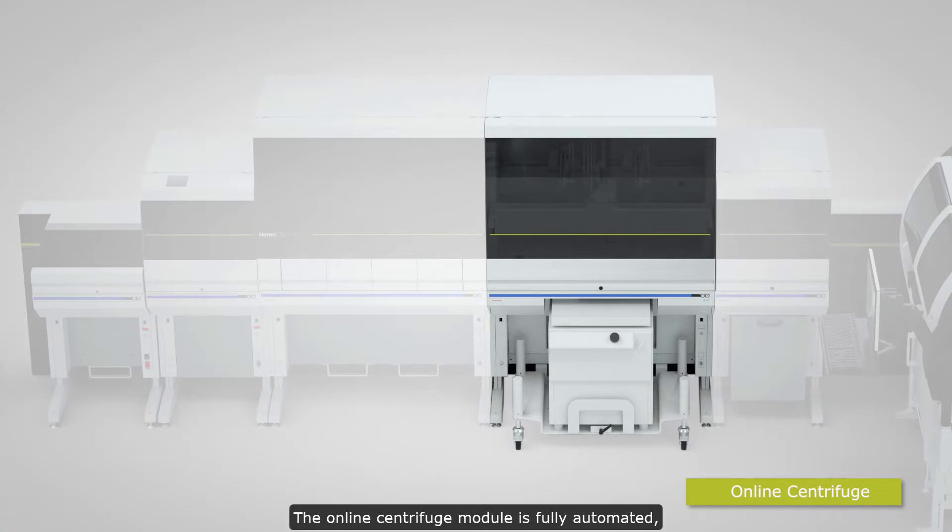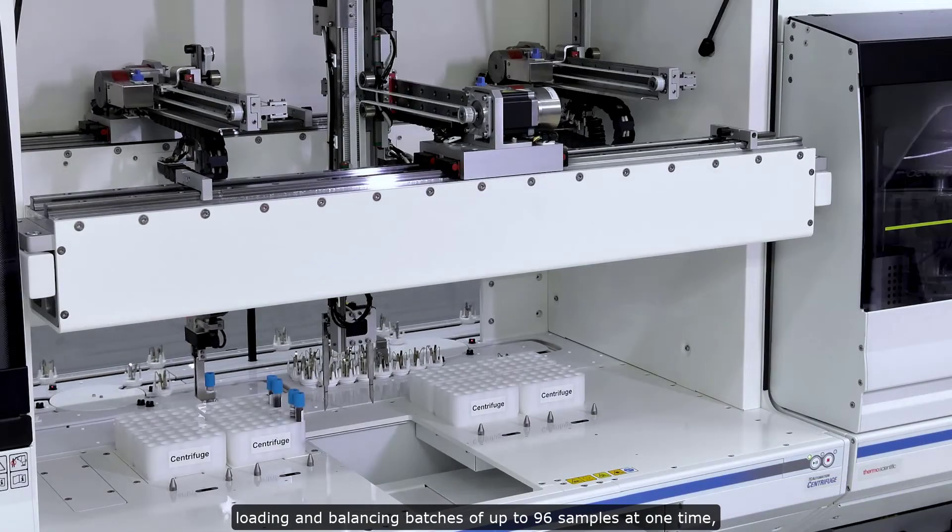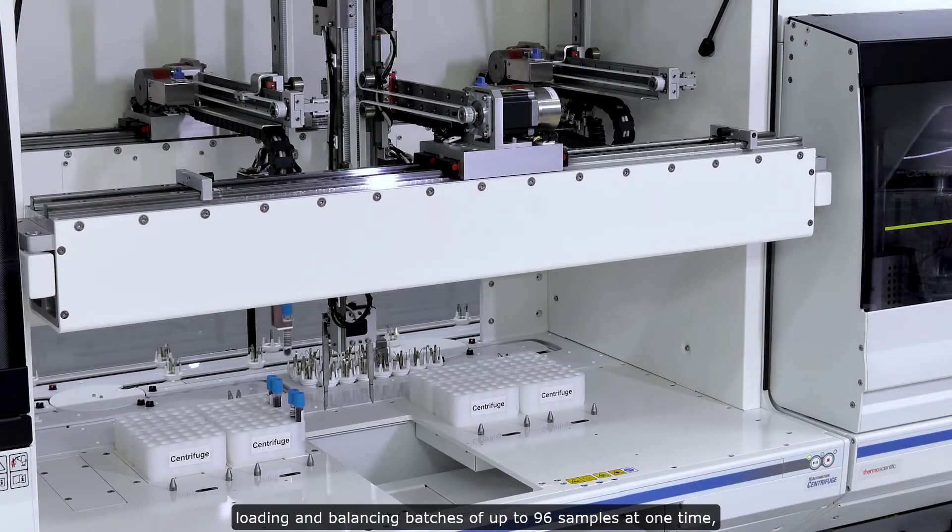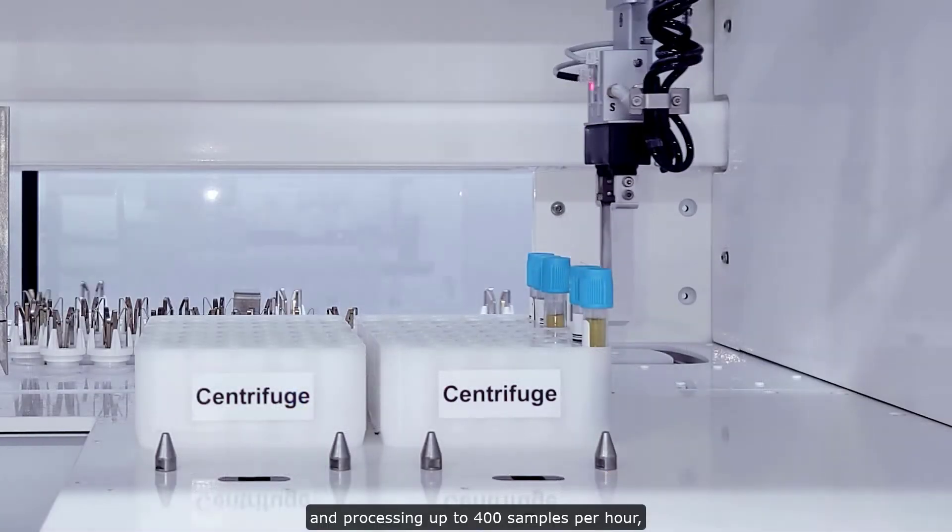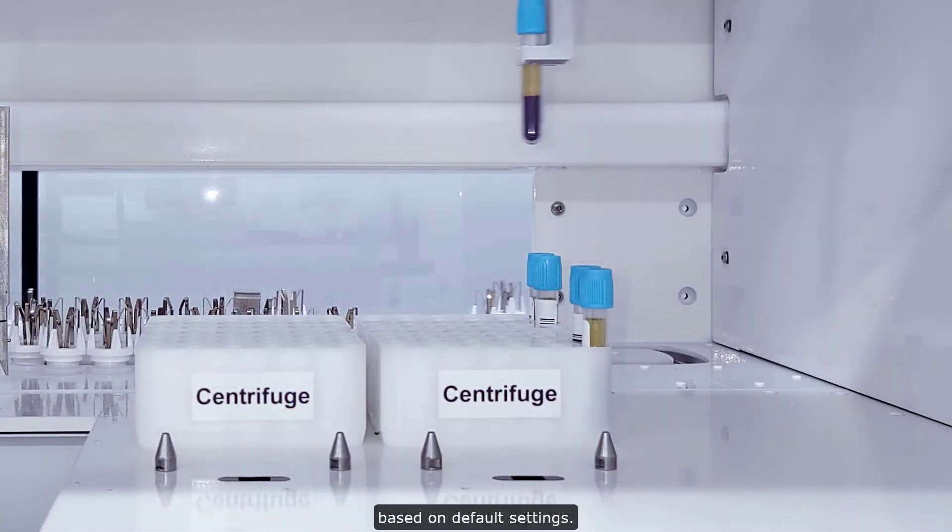The online centrifuge module is fully automated, loading and balancing batches of up to 96 samples at one time, and processing up to 400 samples per hour based on default settings.